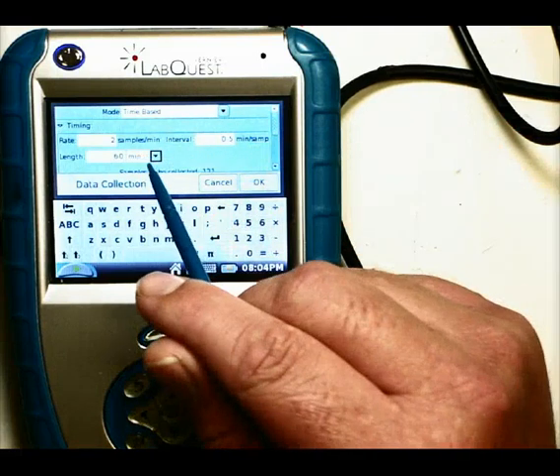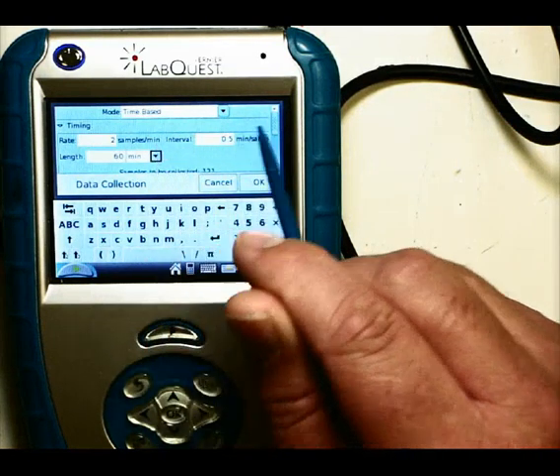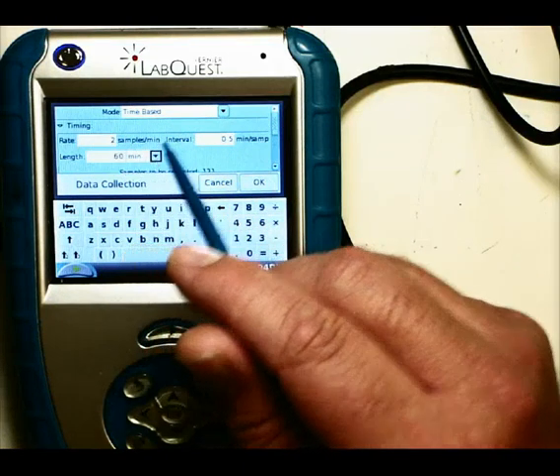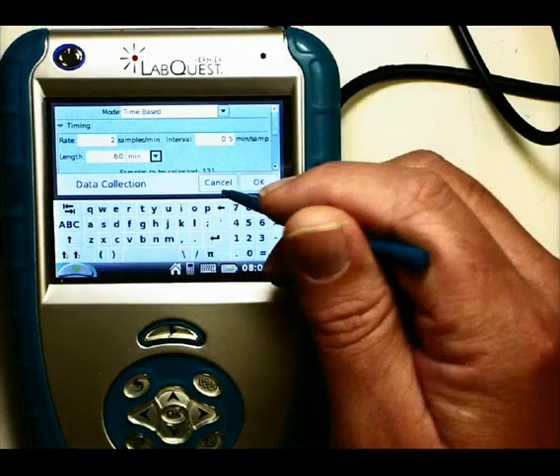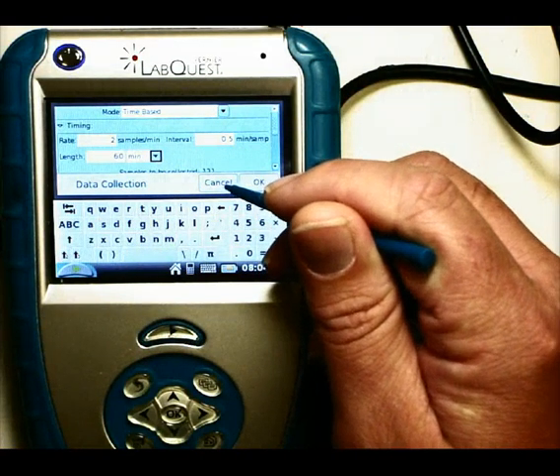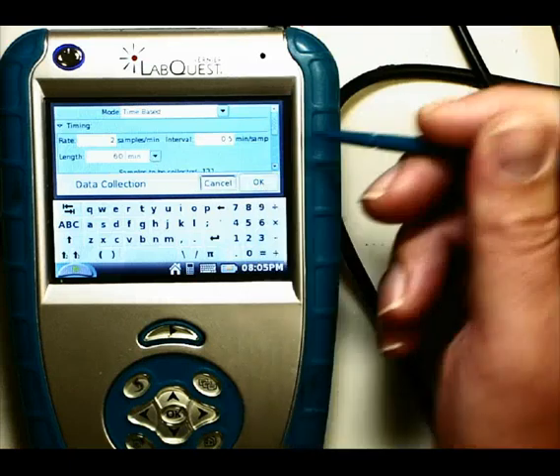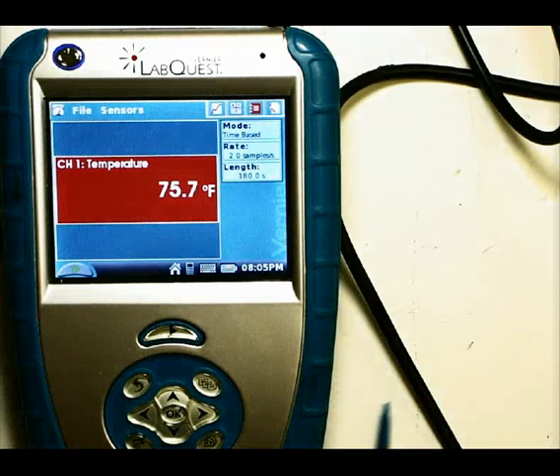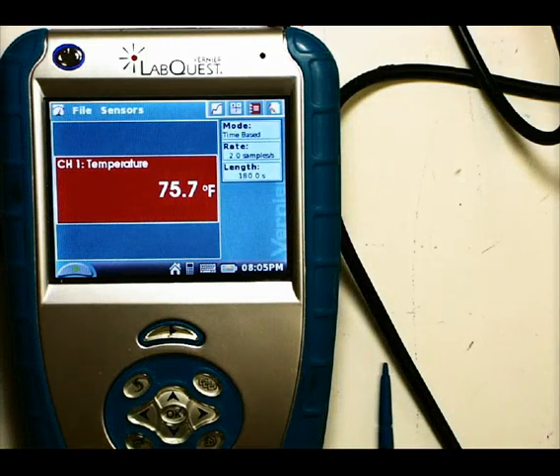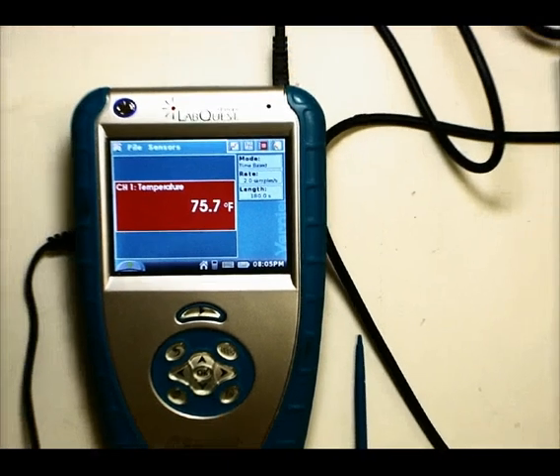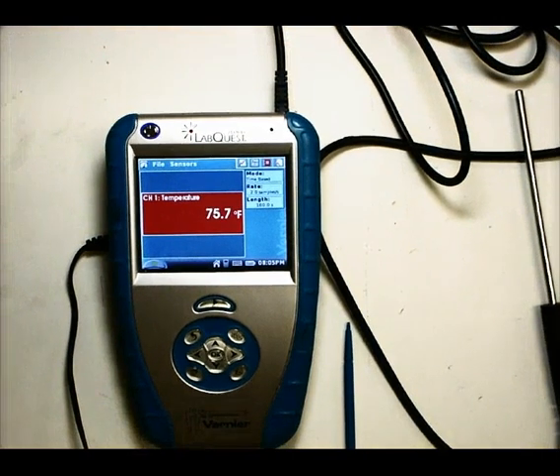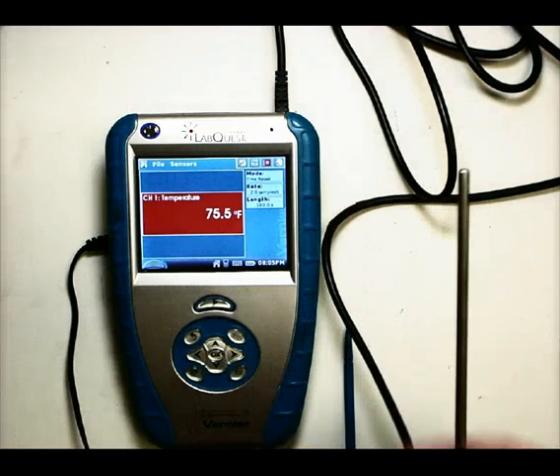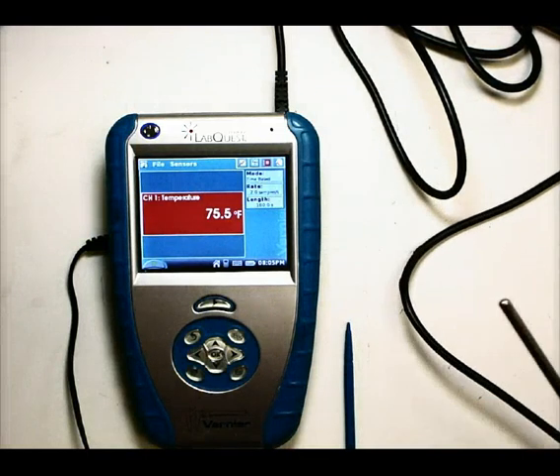Notice that when I change the unit to minutes, it changed to minutes up here as well, so now it shows how many samples per minute — checking the temperature two times every minute. With all this, you can set up however you want to. Now it comes time to record the data. You've told the LabQuest how you want it to collect data, so now it's just a matter of doing it. I'm going to take the thermometer and wrap my hand around it so that it gets warmer, but I want the LabQuest to record data about this.